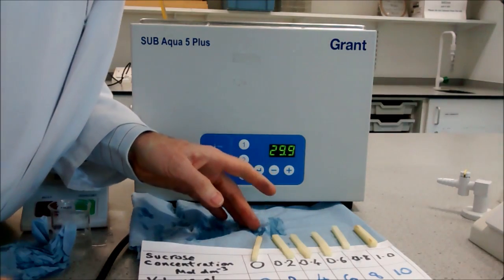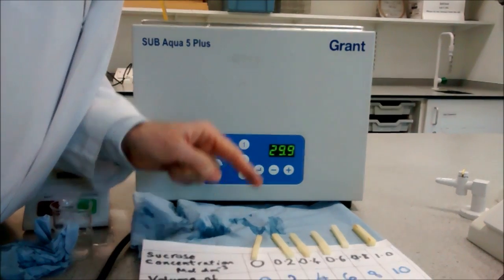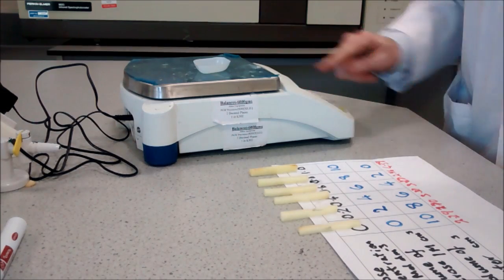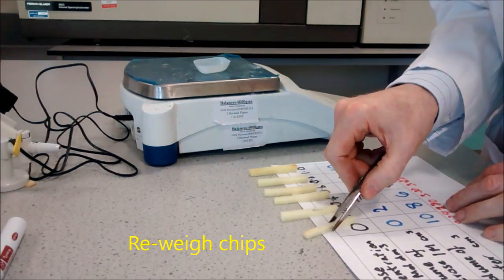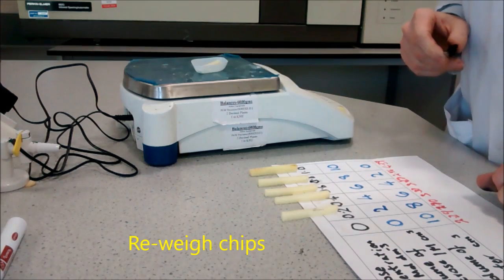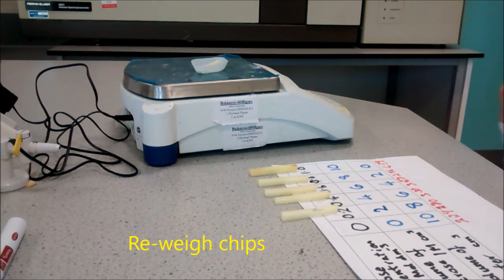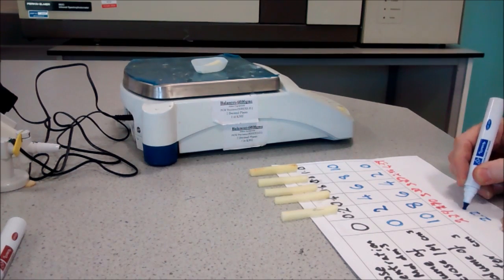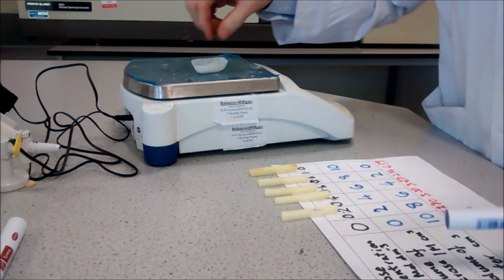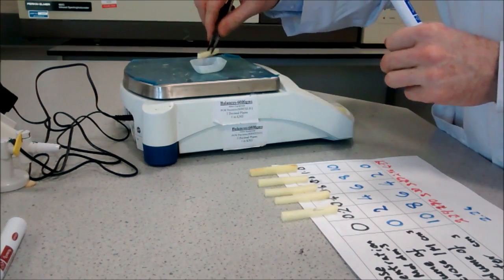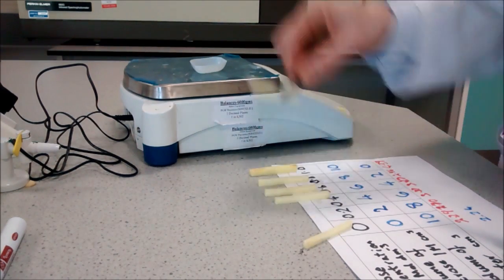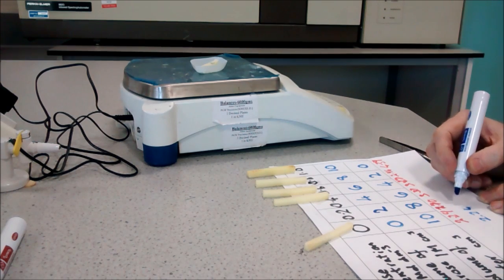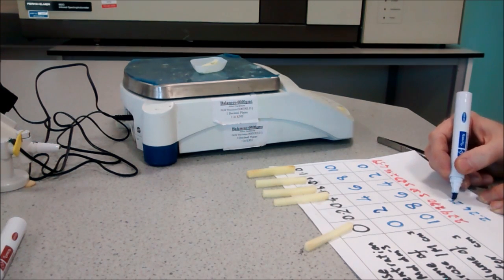Once you've dried all your chips, they need to be individually weighed. Check the tare of the balance so it reads zero. Take the first chip, place it in, and record the mass. Then the next one, recording it along with the previous values.